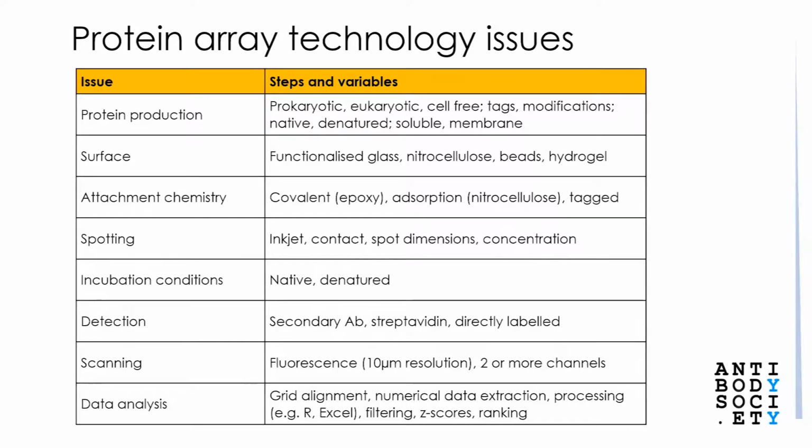Our own experience is that in many cases there is evidence of correct folding of soluble proteins, which can also be monitored by intentional denaturation. Integral membrane proteins, such as GPCRs, are in a particular category, of course, but this may not affect specific binding of an antibody to linear epitopes.